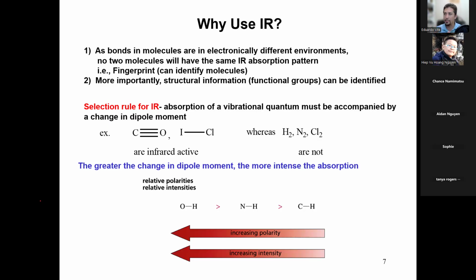So how does the detector pick up the IR spectrum? Well, first of all, there are two conditions that have to be met. The first condition is the bond itself has to be polar. In other words, two different atoms, not the same one. O2 is not polar. It's oxygen and oxygen. There's no dipole, right? N2 is not polar. Cl2 is not polar. F2 is not polar. Carbon-carbon bonds are not polar. They're the same atom. Make sense? It has to be different atoms.